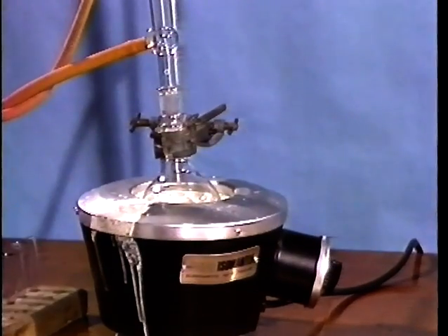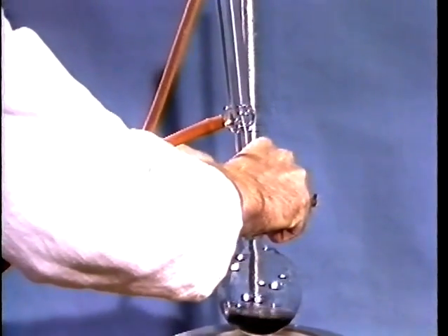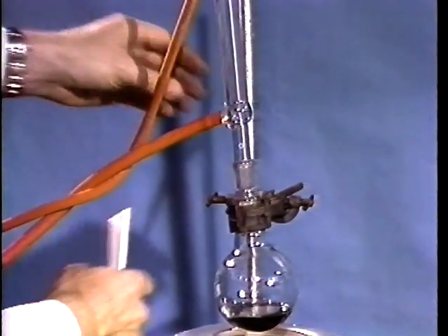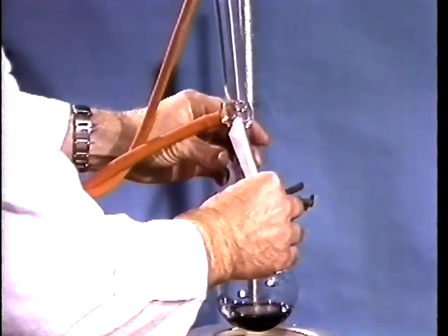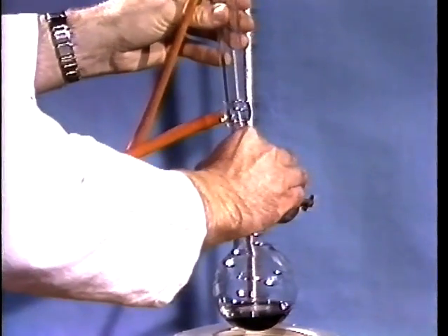Turn the heating mantle off, lift the apparatus from the heating mantle, and carefully remove the condenser from the flask, remembering that it may be hot. A piece of folded up filter paper is useful in handling the hot glass at this stage.